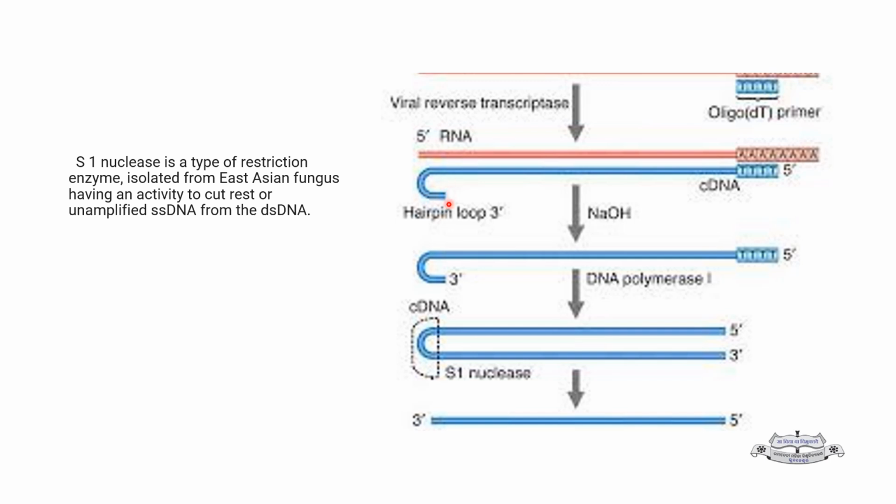After this, the activity of the reverse transcriptase stops, and now this loop area becomes double-stranded, and once there is a double-stranded region, then the reverse transcriptase or DNA polymerase can get attached here and it will start synthesizing the second strand of the complementary DNA, and finally the loop can be removed by using S1 nuclease, single strand specific nuclease enzyme.